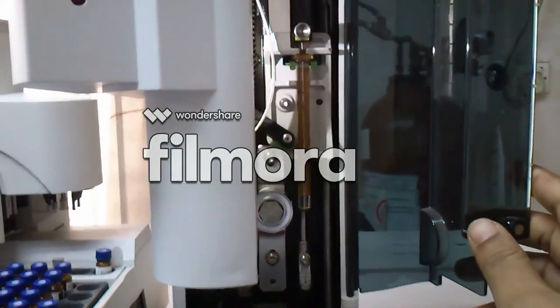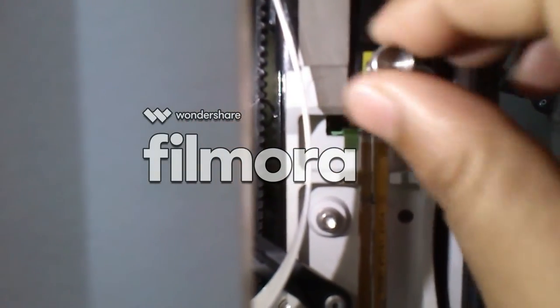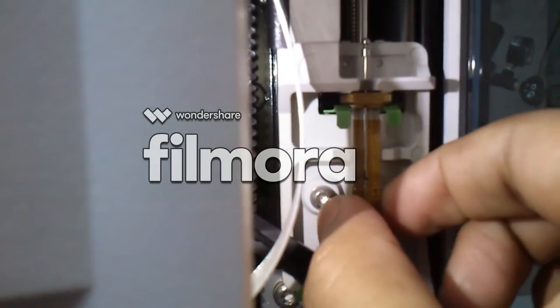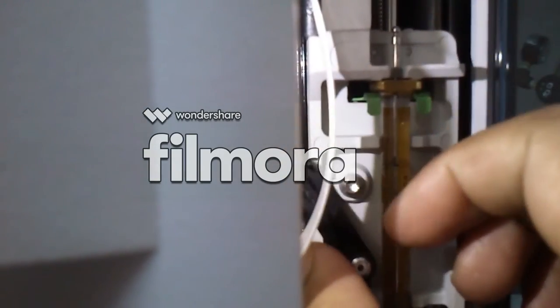You can easily open the door by pulling it outwards. Now unscrew the upper screw of the syringe and pull it up. The black clip can also be easily removed by pulling it leftward.